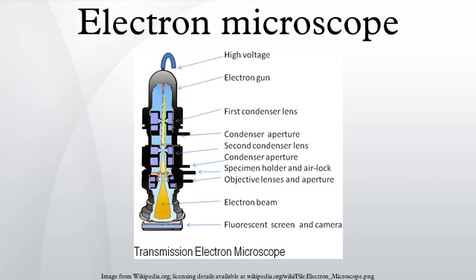Resolution of the TEM is limited primarily by spherical aberration, but a new generation of aberration correctors have been able to partially overcome spherical aberration to increase resolution. Hardware correction of spherical aberration for high-resolution transmission electron microscopy has allowed the production of images with resolution below 0.5 angstrom and magnifications above 50 million times. The ability to determine the positions of atoms within materials has made the HRTEM an important tool for nanotechnologies research and development. An important mode of TEM utilization is electron diffraction.